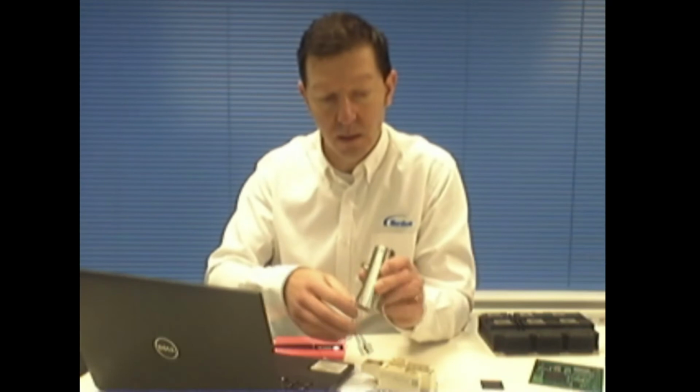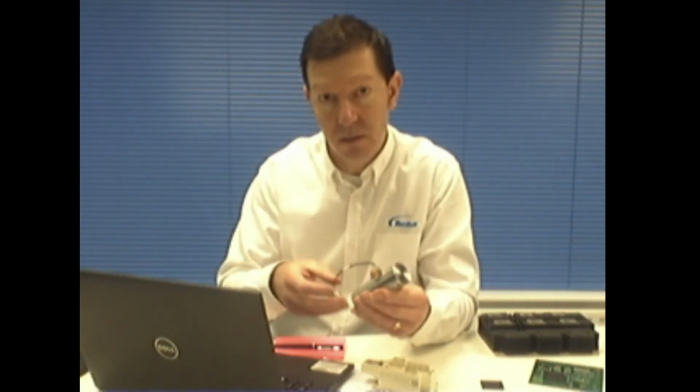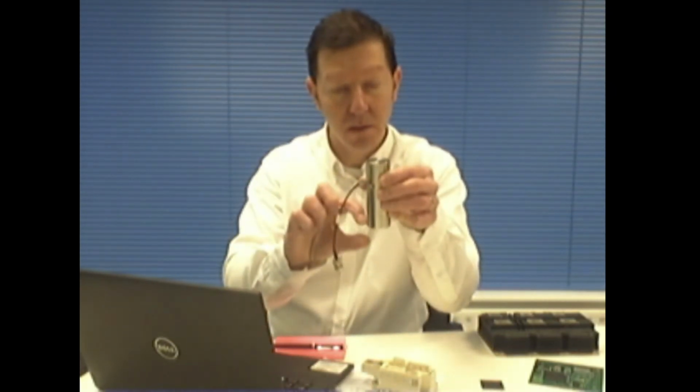So we're using between 5 and 500 megahertz. If you want to change the frequency, you need to change the transducer. This one is a 100 megahertz transducer with 1/2 inch focal length. You want to use the highest frequency you can to get the best resolution, but you're limited by the material that you need to penetrate.